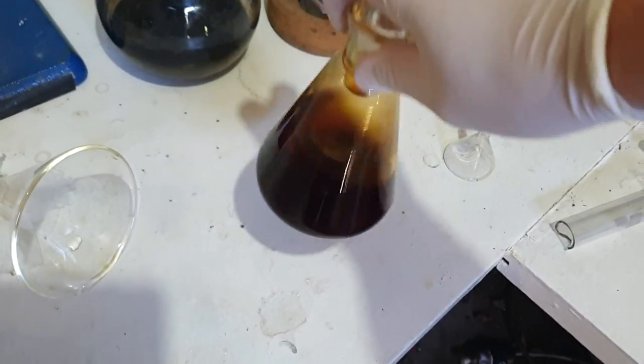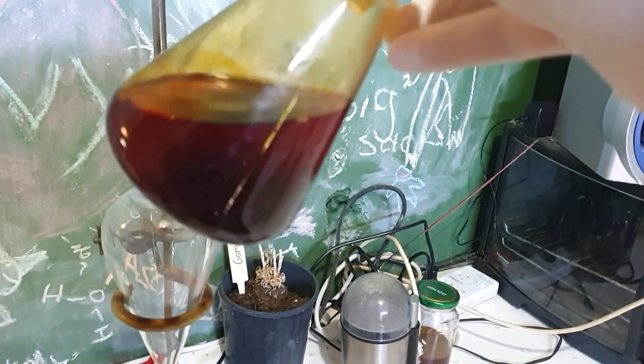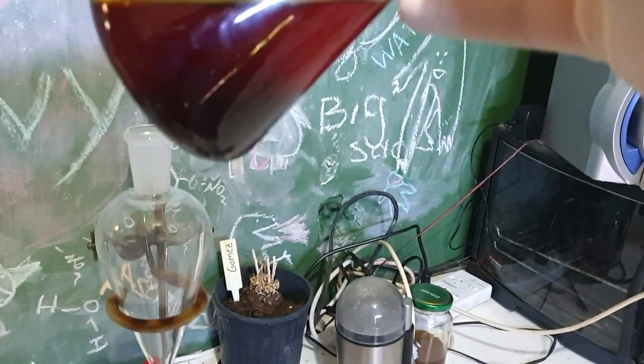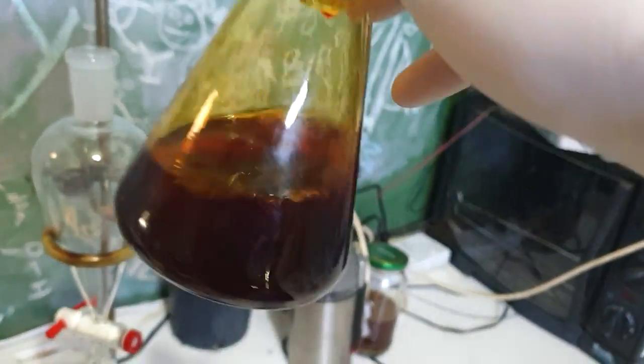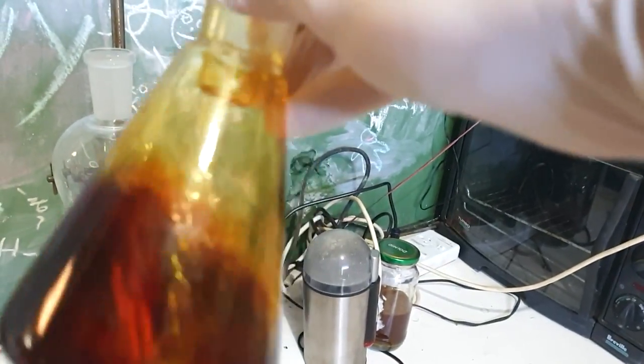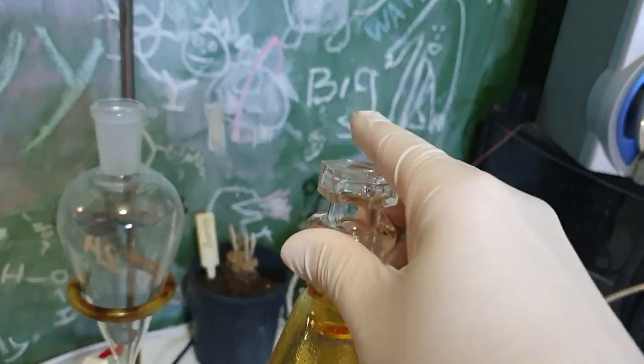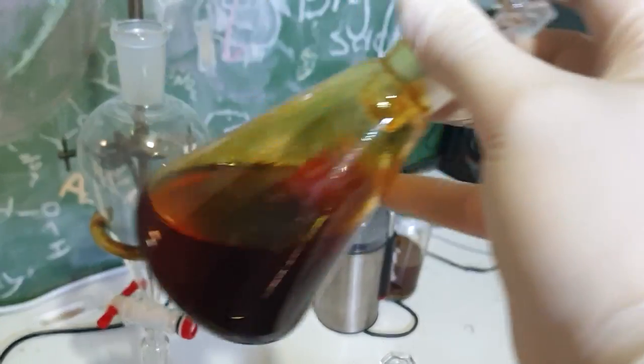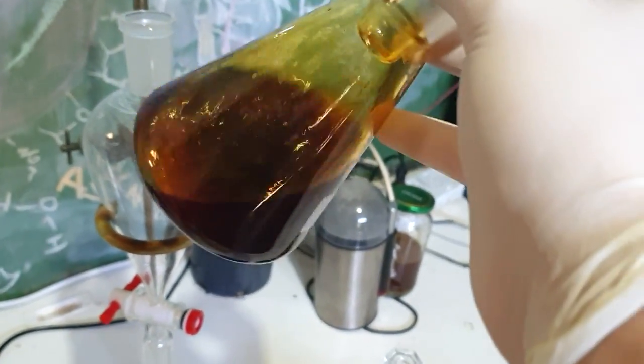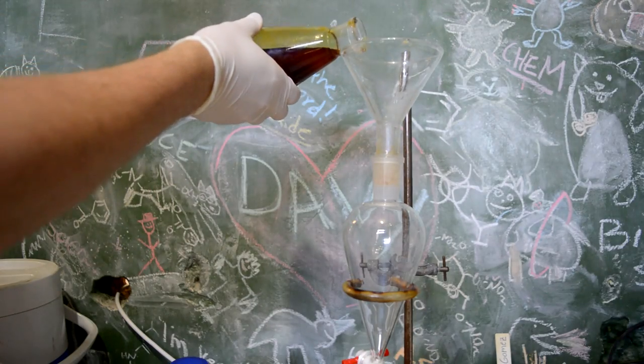All right, so this is what it looks like after an hour. I'm going to get into the sep funnel here, because there is two layers. We'll separate that off and then I'm going to put that top layer back over some potassium hydroxide just to further reduce this red color out. That yellow is getting sort of dragged out of solution—it's polymerizing, so that when we go and distill it later on it won't come over with our dioxane.